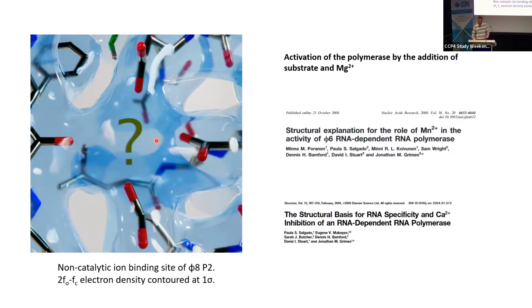Now, obviously, we have looked at the crystallization condition, and it's full of calcium. So it's likely to be calcium. But if you're going to make a hypothesis about the role of the calcium, you need to have a bit more confidence in the fact that it is a calcium. You need a different way to justify that it's a calcium, apart from the fact that it's present in the condition.